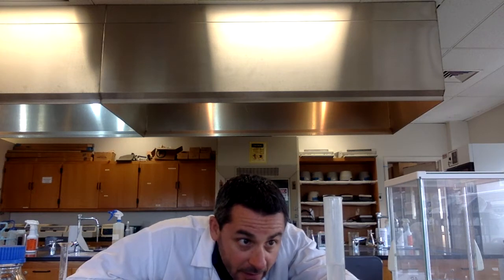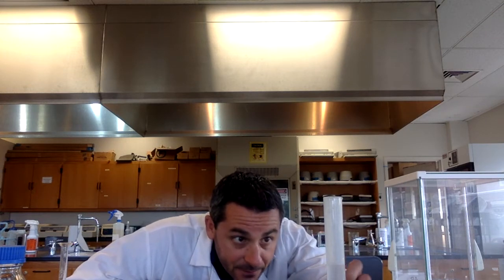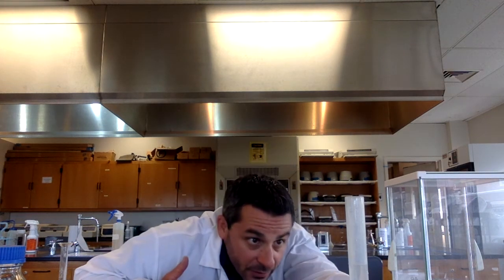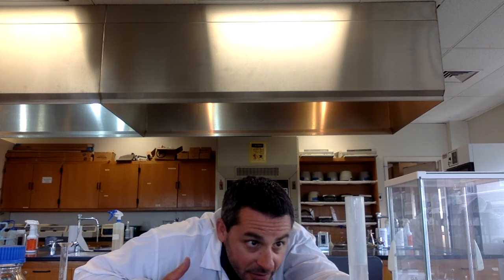This graduated cylinder goes up to 100 milliliters, and the little graduated marks are each a milliliter. This one is in between 59 and 60. Now I can estimate that decimal place, within reason. It's a little bit closer to 59, so 59.3 milliliters is the volume.